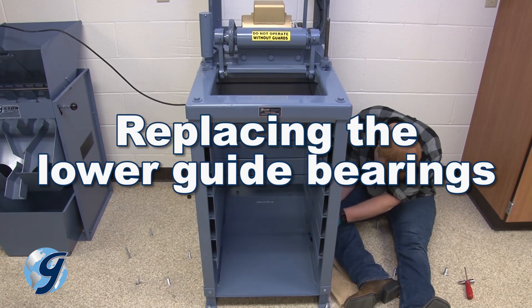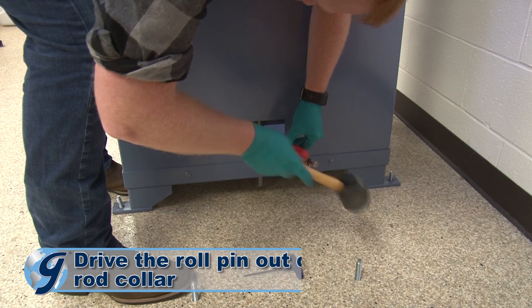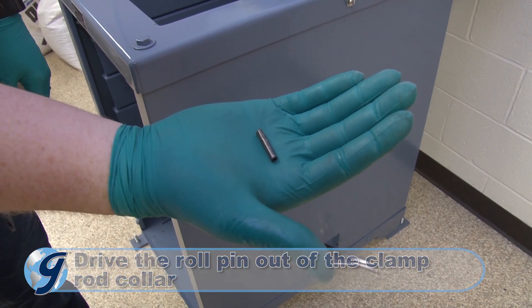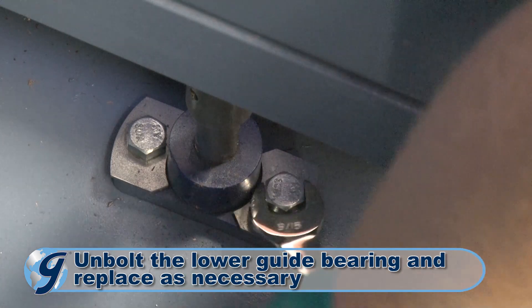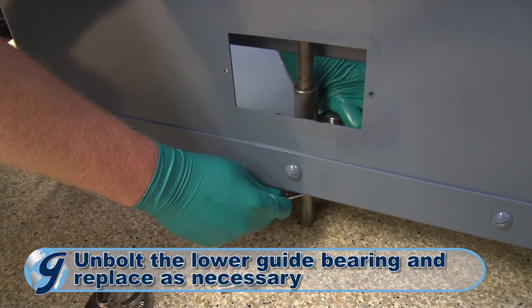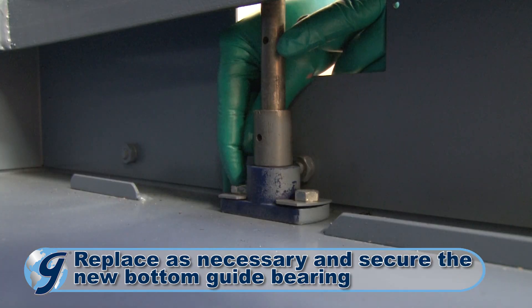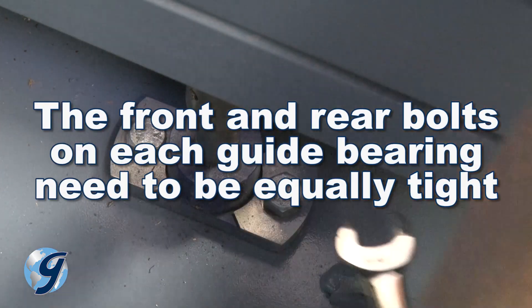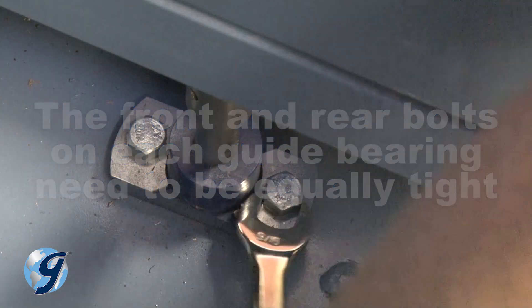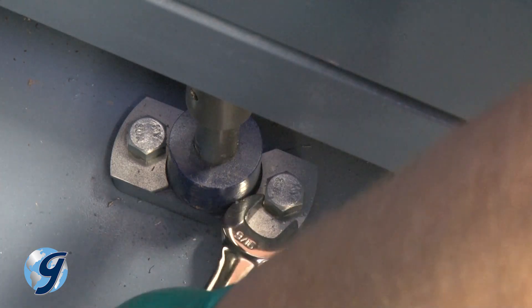To replace the lower guide bearings, work through the access hole near the base of the machine and drive out the roll pin on the clamp rod collar. Slide the collar low enough to raise the clamp rod out of the bottom guide bearing. Unbolt the lower guide bearing from the unit. Replace and secure the new lower guide bearing to the unit. Please note that the front and rear bolts on each guide bearing need to be equally tight. If screws or bolts repeatedly loosen during operation, use a little Loctite.